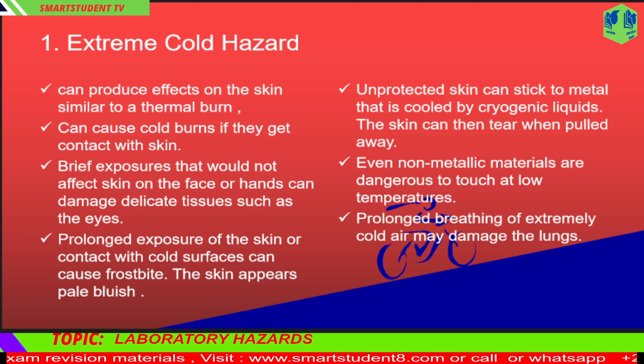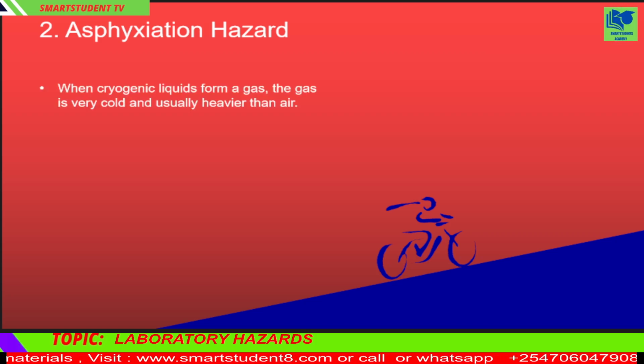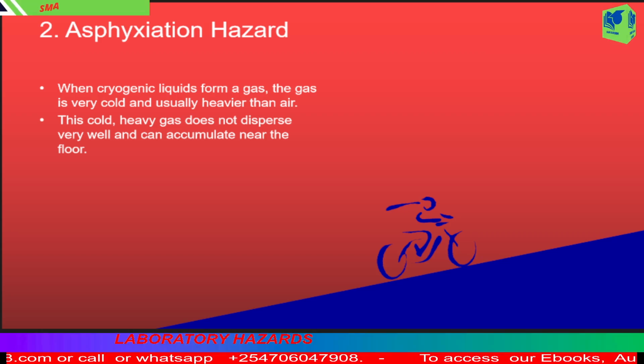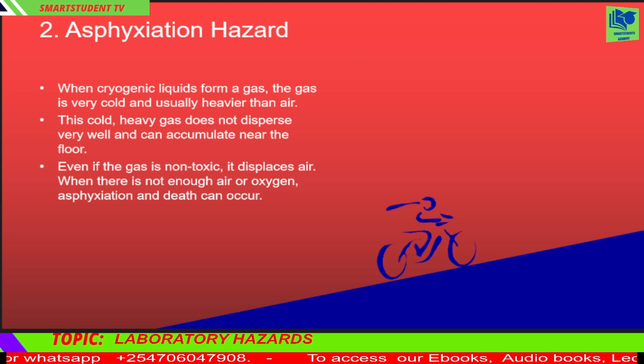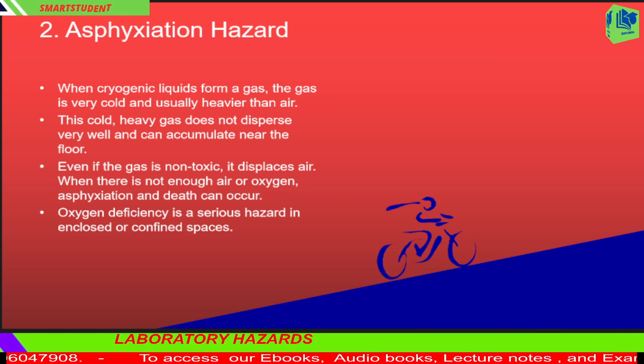2. Asphyxiation hazard. When cryogenic liquids form a gas, the gas is very cold and usually heavier than air. This cold, heavy gas does not disperse very well and can accumulate near the floor. Even if the gas is non-toxic, it displaces air. When there is not enough air or oxygen, asphyxiation and death can occur. Oxygen deficiency is a serious hazard in enclosed or confined spaces.